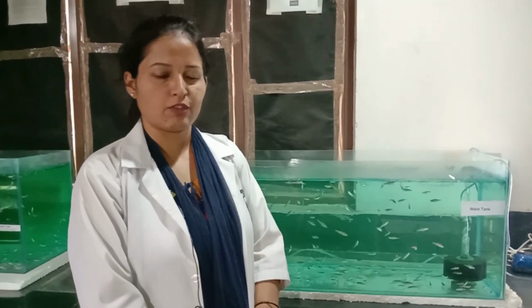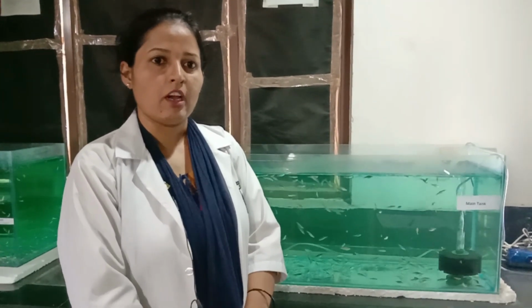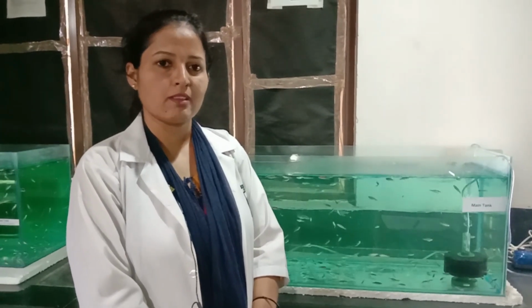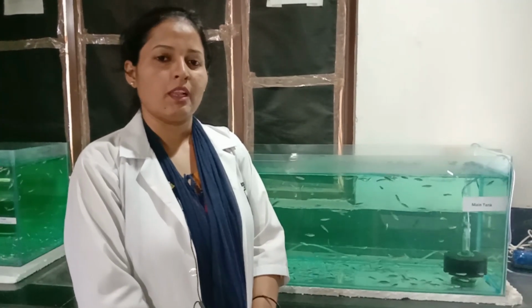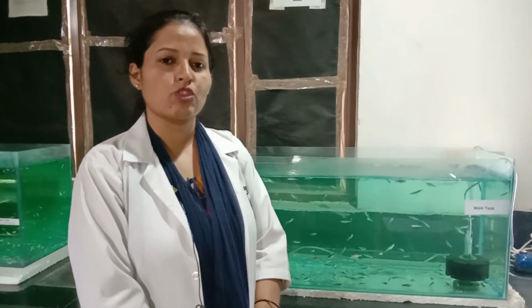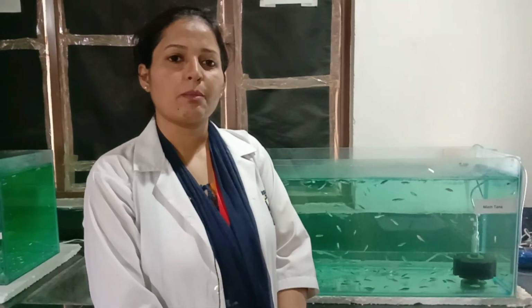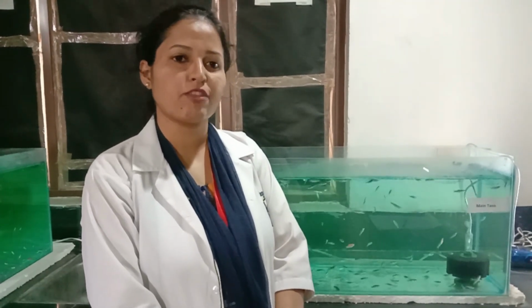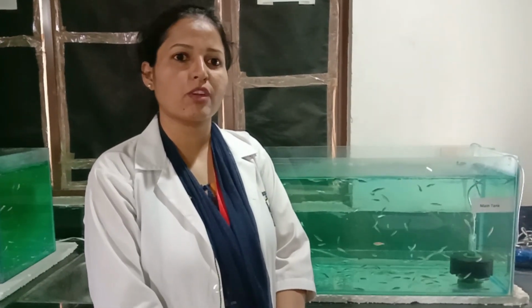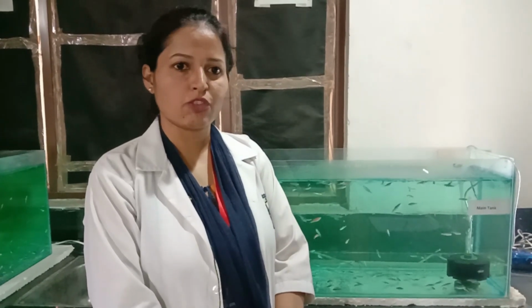Zebrafish model of cognitive dysfunction. Cognitive dysfunction, as we all know, is a kind of neurodegenerative dysfunction affecting one or more of the 6 cognitive domains like executive function, complex attention, learning and memory, language, perceptual, social and motor cognition. Zebrafish, because of the many advantages that we have discussed earlier, is considered a preferable model nowadays. So today in this session we demonstrate a zebrafish model of cognitive dysfunction using the behavioral apparatus T-maze. So let's start with the demonstration part.